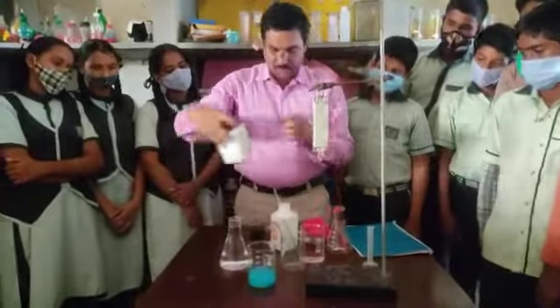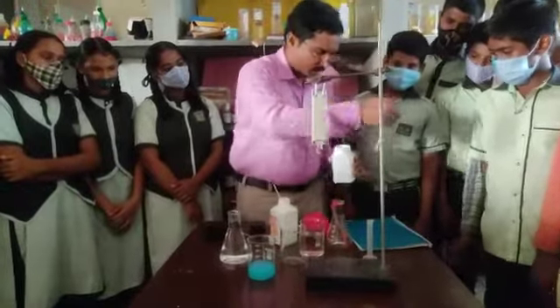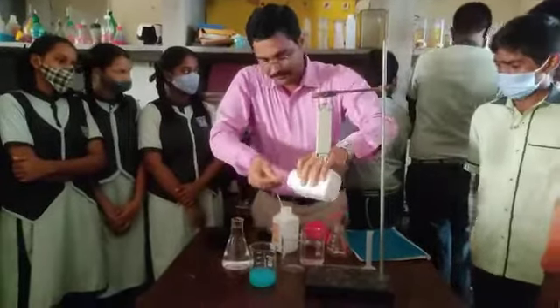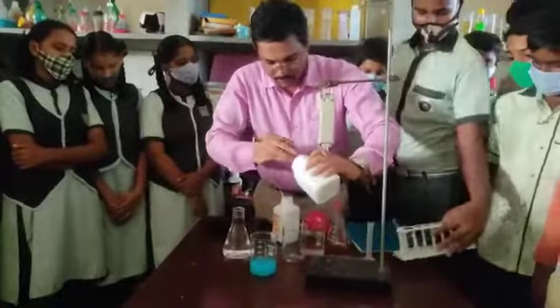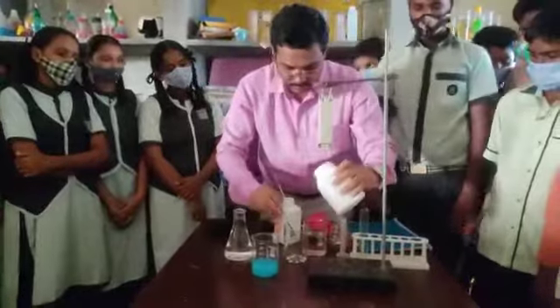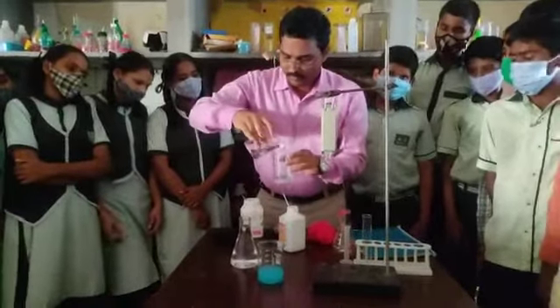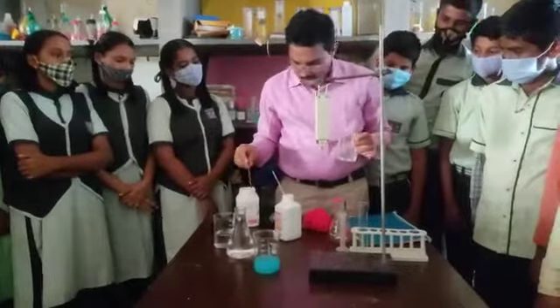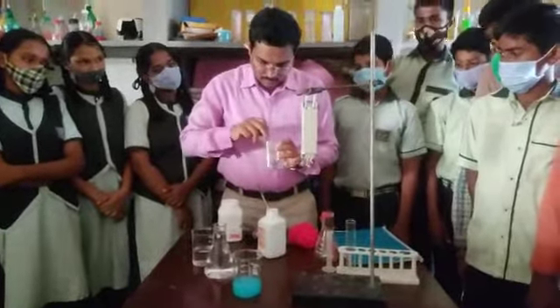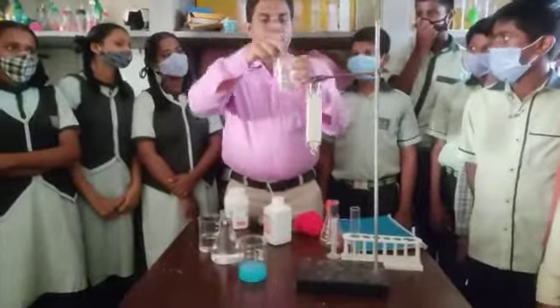After that, go for preparation of sodium hydroxide solution. Take out sodium hydroxide in the beaker. Add water to the beaker, then go for stirring for proper mixing. The sodium hydroxide solution is now prepared.